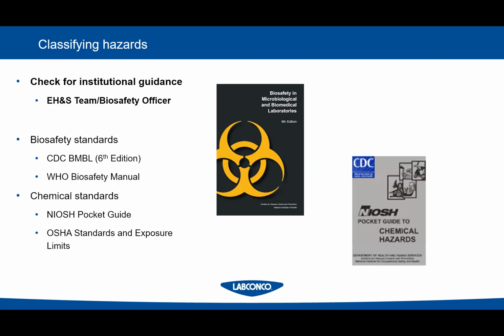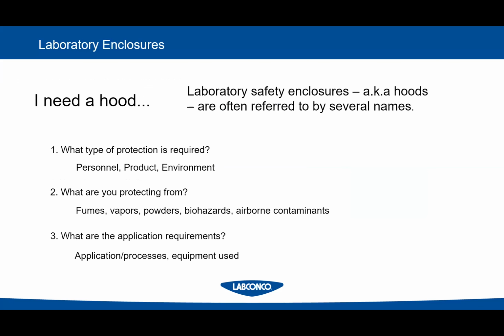For chemical standards, or powder standards, we typically look at NIOSH or OSHA through the CDC for exposure limits, right? So it's not necessarily about, I can't have any of this around. It's about how much of that chemical can be around and what the occupational exposure limits are for that. That's not exactly how we look at biohazards, right? I don't care if it's a little bit of TB or a lot of TB. I don't want to have it around me, right? So it's a little bit different sometimes when you talk about chemical powders.